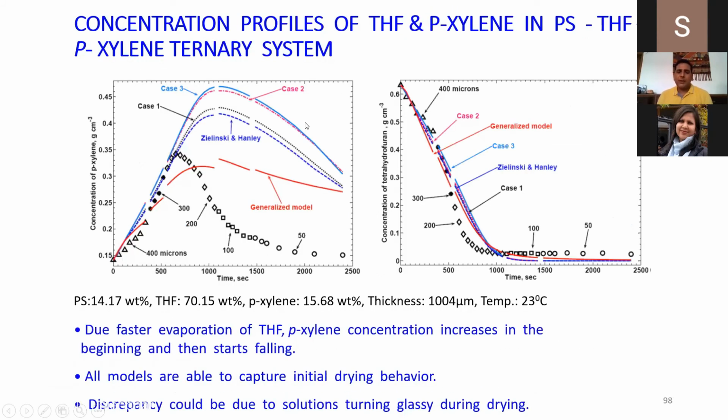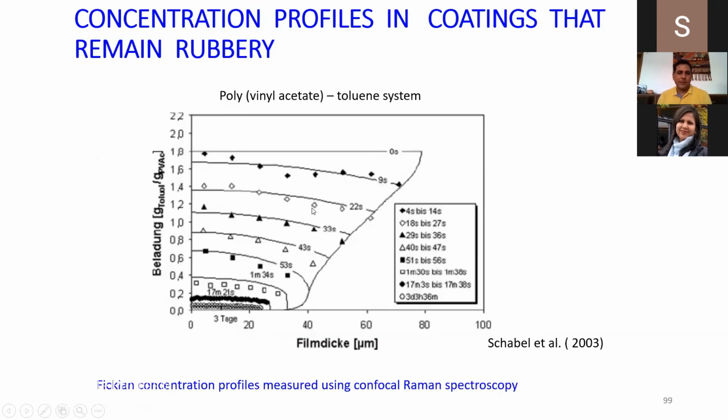So you can calculate concentration that way. Now, once you calculate concentration, you can do the analysis of your sample. So I did the depth profiling of my polymer film at 50 micron, then 100 micron, then 200, 300, and we validated with some model. That's not part of the concern. I just want to show that we can collect the depth dependent data from confocal. Then other people did it here.